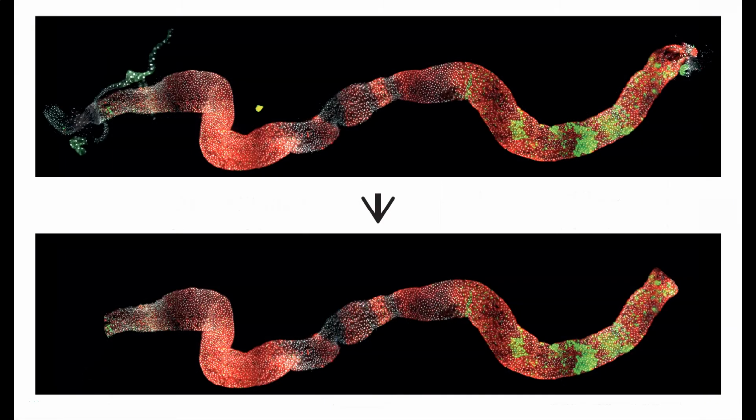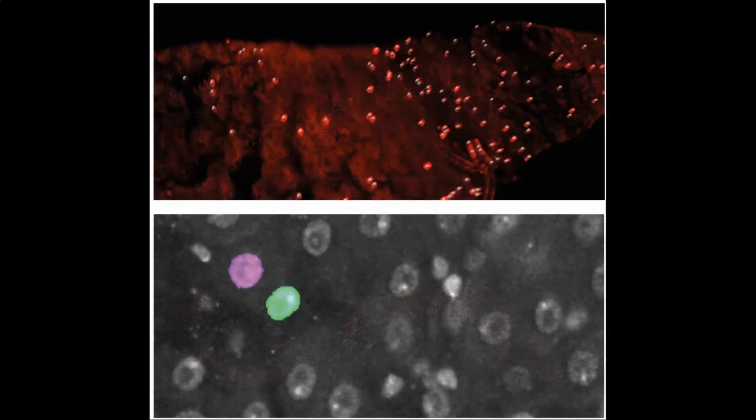First, it should be noted that the quality of the analysis is highly dependent on the quality of the input data. This means that the microscopy images should always be masked to only contain intensities of the samples and to make sure that object detection and segmentation have as high accuracy as possible.